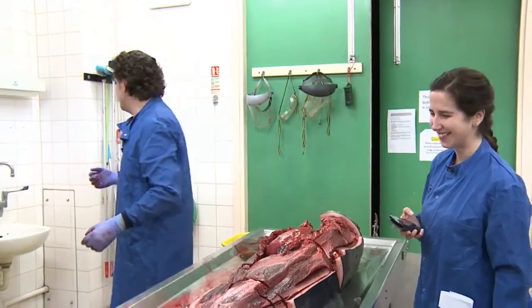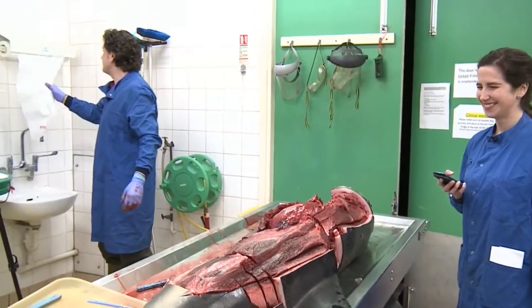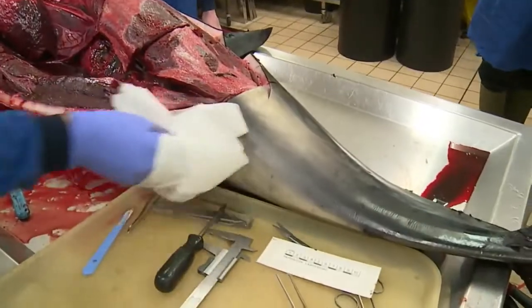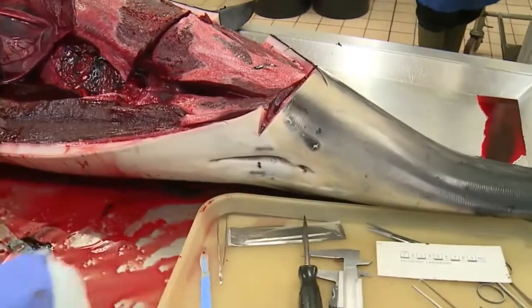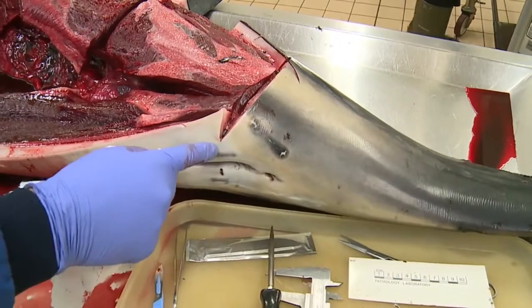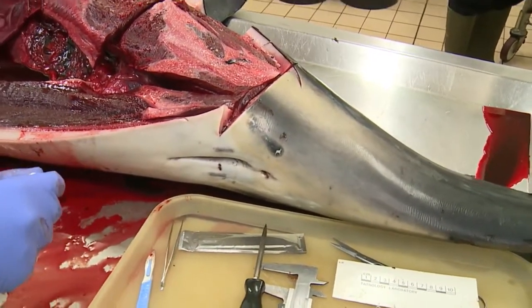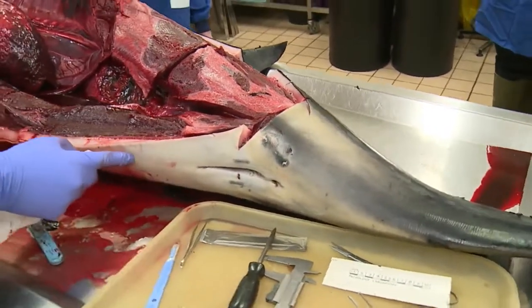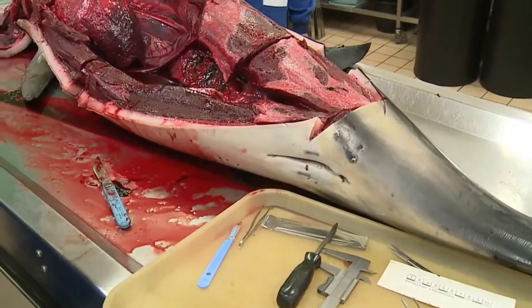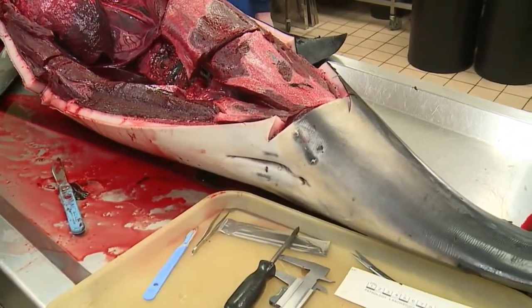Let me clean up a little bit here. So yeah, cetaceans are easy to sex. If we have the camera back over here, this area. So we have the anal genital region and then two smaller mammary slits either side. So that's a female, so three holes essentially. In a male, we have the penile slit further forward, anus further back, so two holes male. And they're all broadly the same, apart from some confusing beaked whales which have pseudo mammary slits.